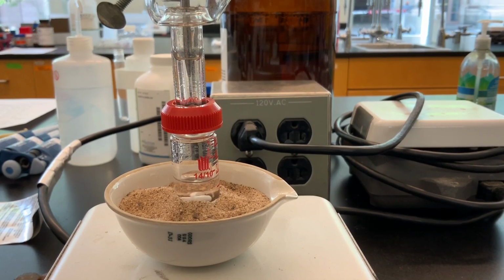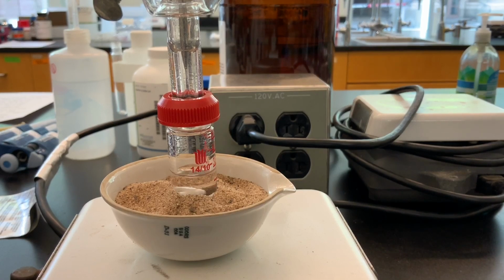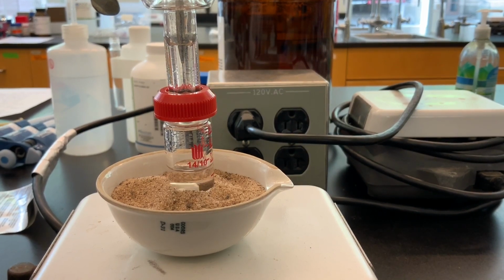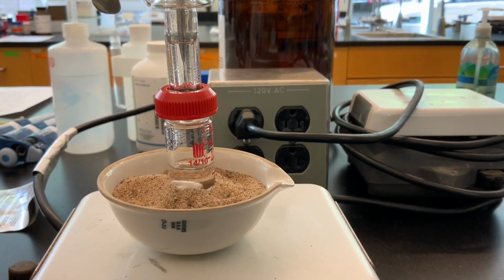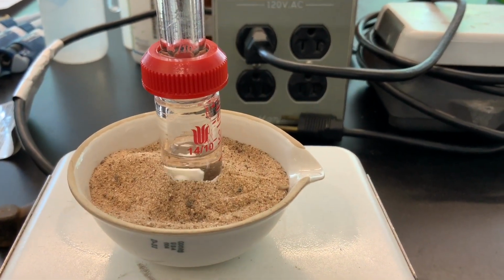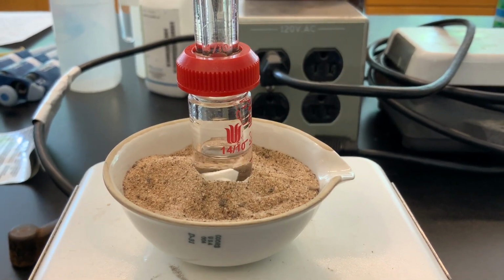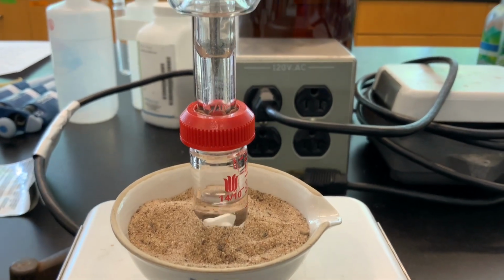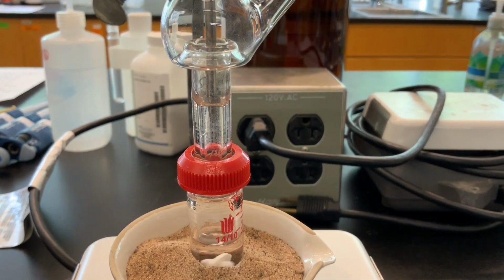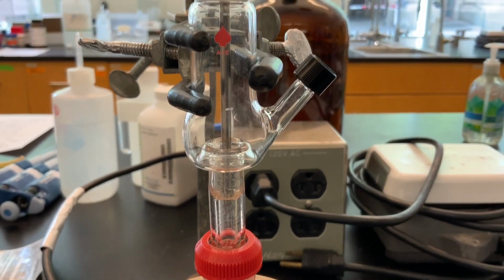Okay, so after waiting about 4 minutes, we see that in the reaction vial, something is boiling. And of course, that's going to be the lower boiling component, the normal hexane. And our spin vane is spinning very nicely. What we're hoping for is that eventually the vapors are going to travel upward, reach the probe, so we'll know the temperature of the vapors, the distillate, and then collect it in the well of the Hickman-Hinkle stillhead.